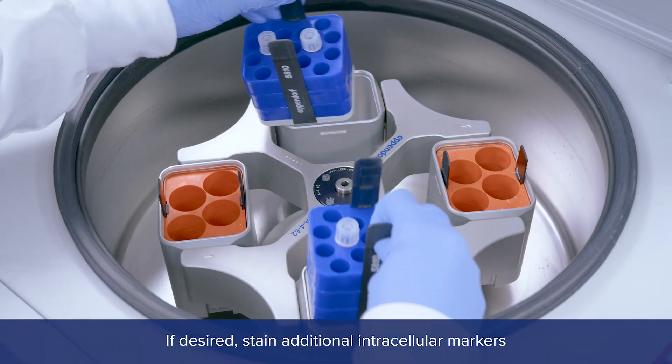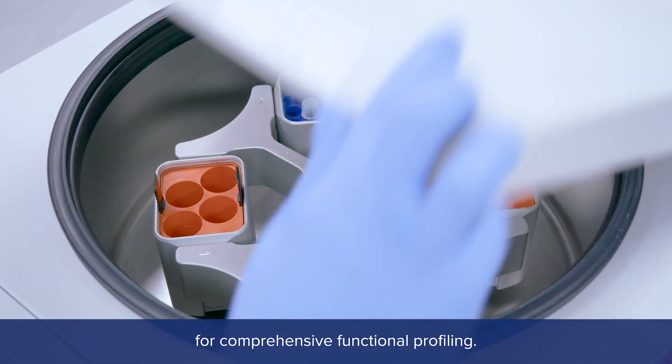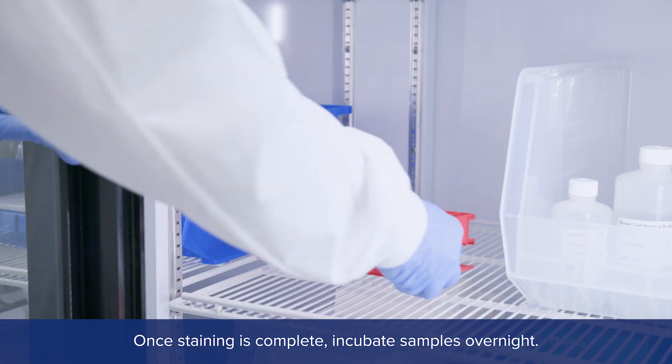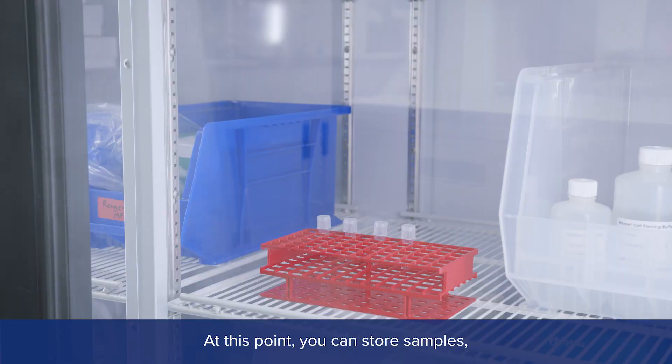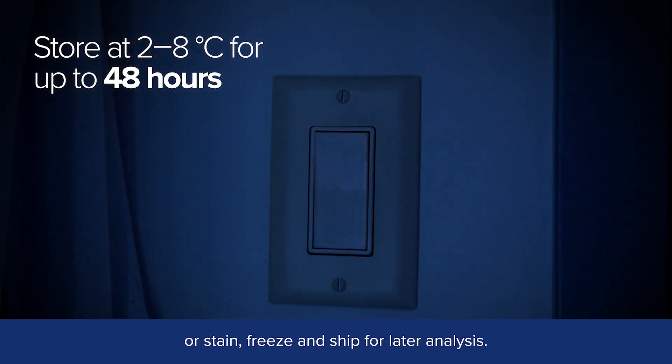If desired, stain additional intracellular markers for comprehensive functional profiling. Once staining is complete, incubate samples overnight. At this point, you can store samples, or stain, freeze, and ship for later analysis.